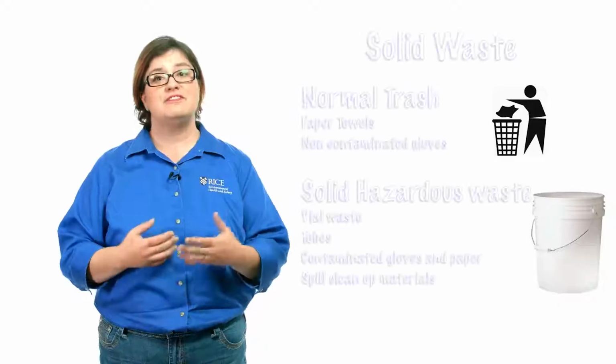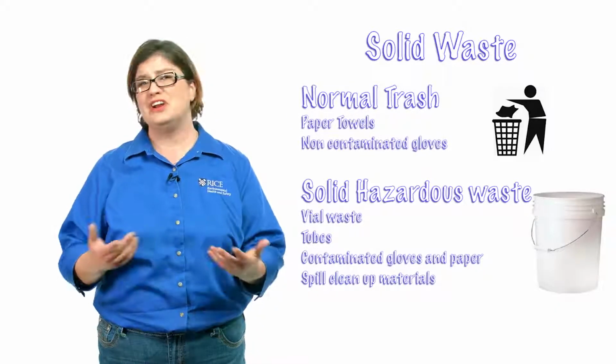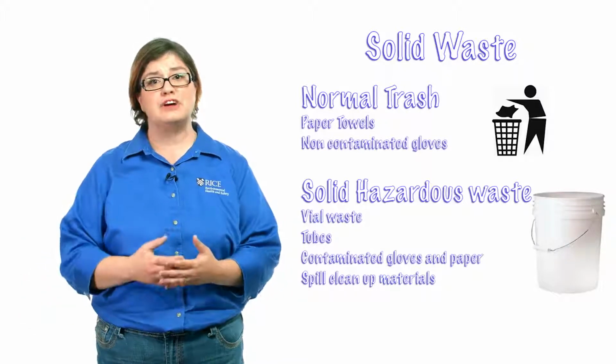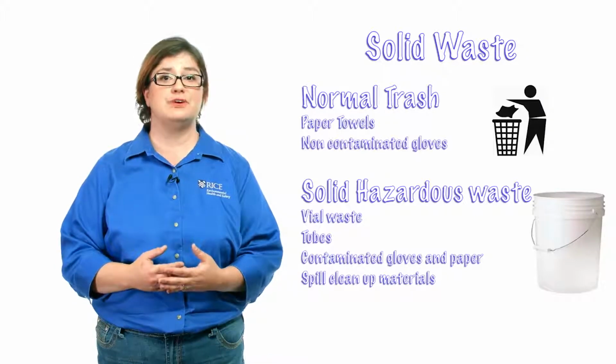Laboratory researchers generally have more questions when it comes to solid waste. That is, they're not sure if they can throw away things like paper towels and gloves in the normal waste. The fact is that if gloves and paper towels are only residually contaminated or not really contaminated at all, they can go in the regular trash. However, if you've used your gloves and paper towels to clean up a spill, you'll definitely want to treat those as solid hazardous waste.